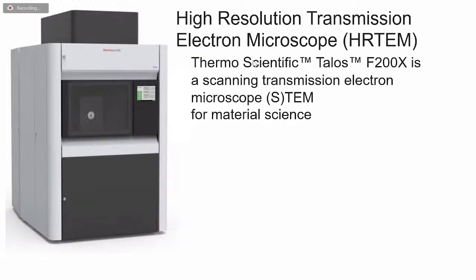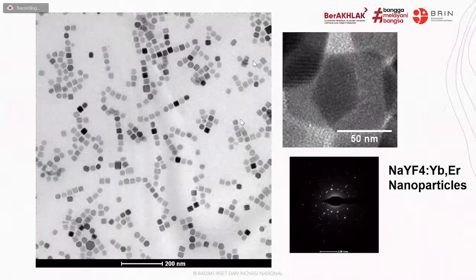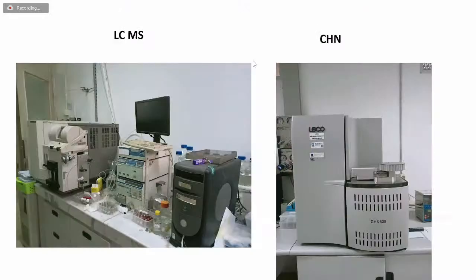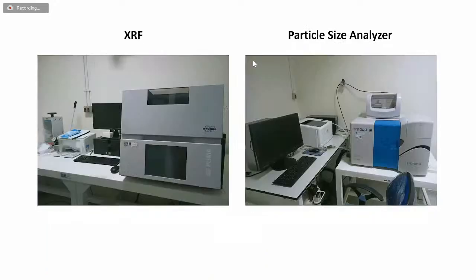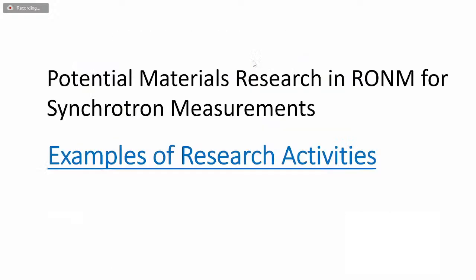And also the high resolution TEM, this HR TEM from Thermo Fisher, will enter at the end of this year also. And this is some image of them. Yeah, and then several apparatus for chemical characterization.